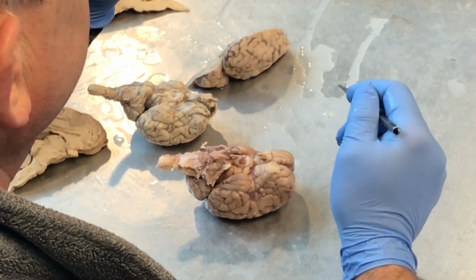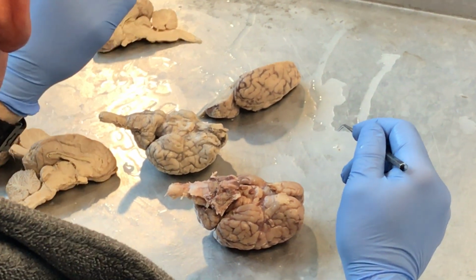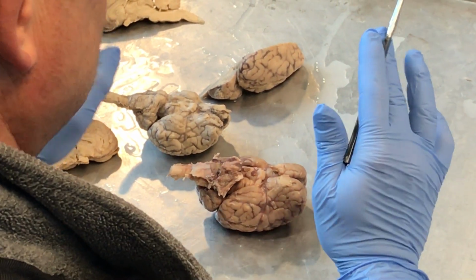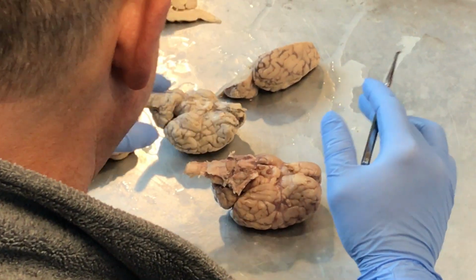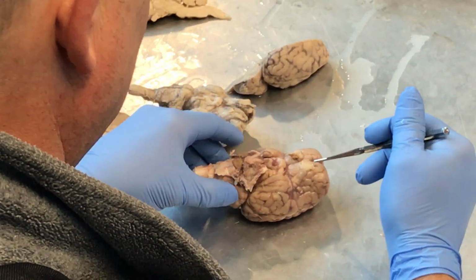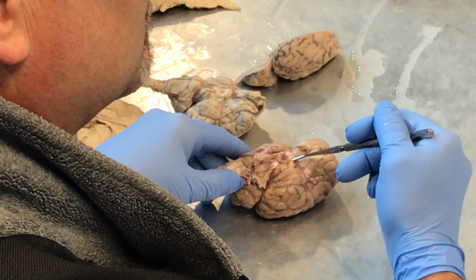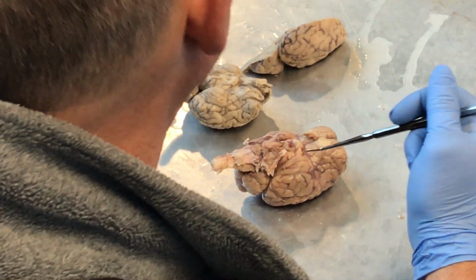And those little thin, almost feather-like nerves get broken off. So then we have to re-tag it, which just makes it a pain in the rear. What you need to know for the lab test on the sheep brain is cranial nerve 1, that's olfactory, and cranial nerve 2, which is the optic. Cranial nerves 3 through 12, you've got to know on a picture like that.